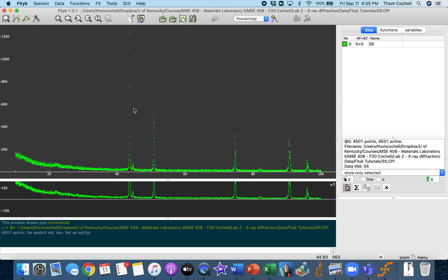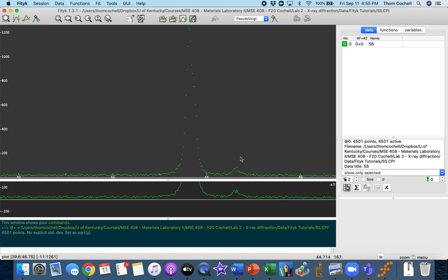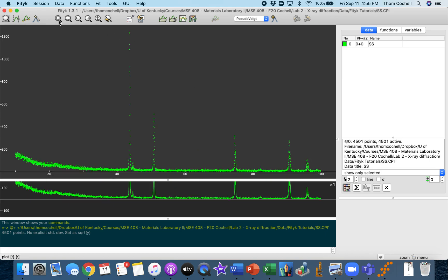One of the main things I like in these types of software when compared to Excel is the ability to zoom in and move around the sample much more easily. So if you look up here, there's the picture of a magnifying glass. If that is selected — that's normal mode or F1 — that will allow you to click and drag a box around a given area and zoom into it. You'll notice I kind of zoomed into this first peak.